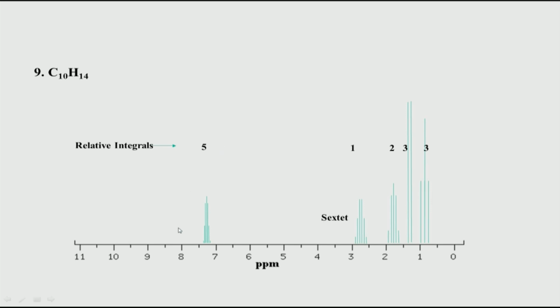Another way is from NMR, you can look at this spectrum here. What will happen is you will get a somewhat complicated peak pattern somewhere between 7 to 8 ppm. Remember we saw that this region belongs to aromatic amino acid side chains, functional groups, but you may also get amides here. But here we do not see any nitrogen and oxygen, so that means there is no amide possibility. So, typically if you see a bunch of peaks clustering around 7 to 8 ppm, immediately it signifies the presence of an aromatic ring.